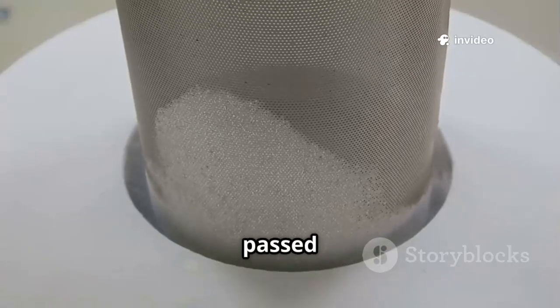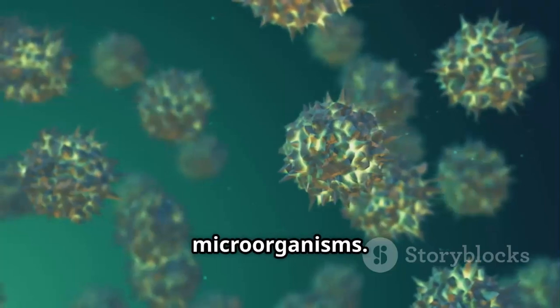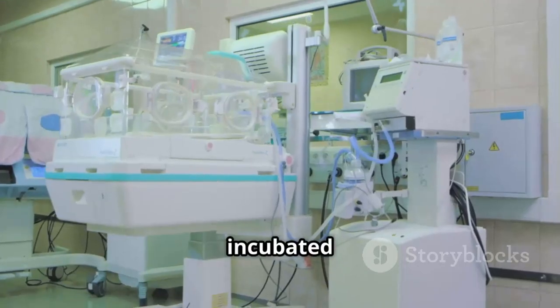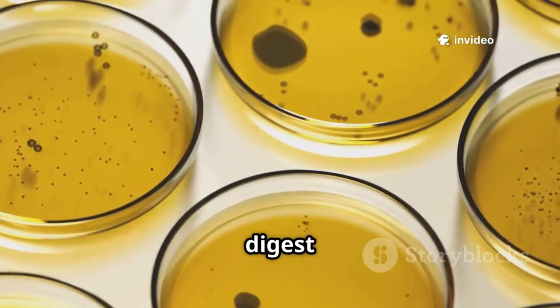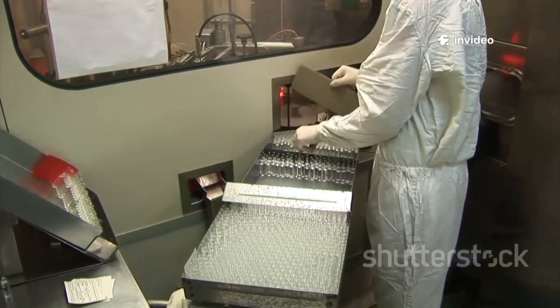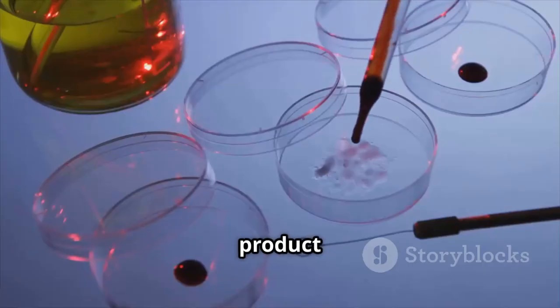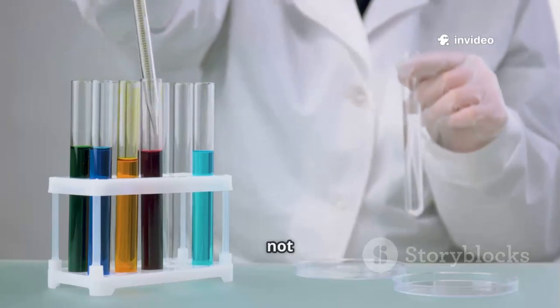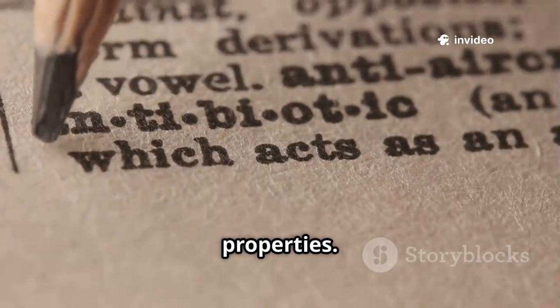The sample is passed through a 0.45 micron filter, which traps microorganisms. The filter is then incubated in fluid thioglycollate medium and soybean-casein digest medium for 14 days, under specific conditions. Second, the direct inoculation method. Here, the product is directly added to the culture media. It is simple, but not suitable if the product is viscous or has antimicrobial properties.